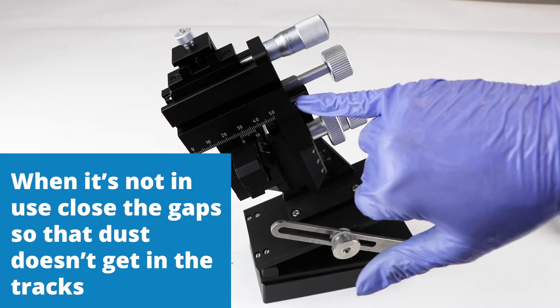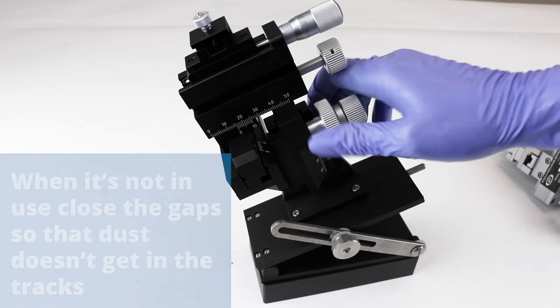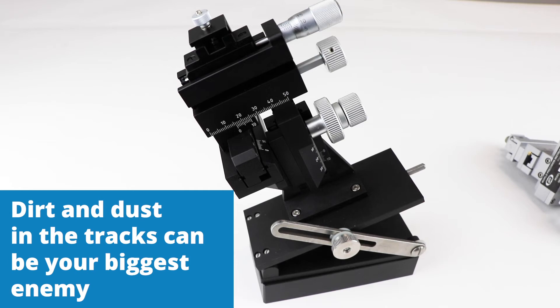When it's not in use, there are exposed guides here and dust can get in those tracks. So when you're not using it, you want to close those up so that they are completely covered and out of the way of dust particles. Then cover it up with a plastic bag or some kind of covering just to keep the dust off.